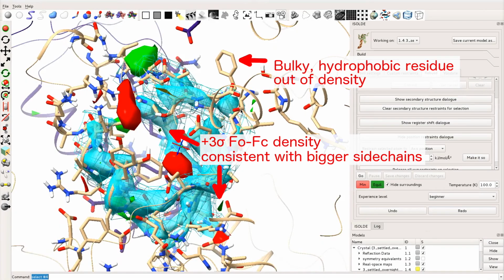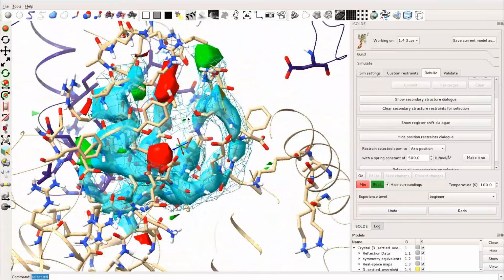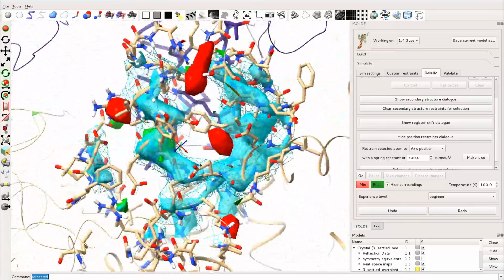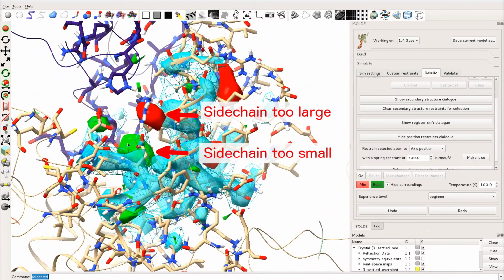This case is characteristic of most that I have seen. A relatively short secondary structure element flanked by two weakly resolved loops. The short length of the well-defined structure makes it easy to misassign side chains, while it is all too easy to slightly over or underpack the loops to get back into the correct register on either side.